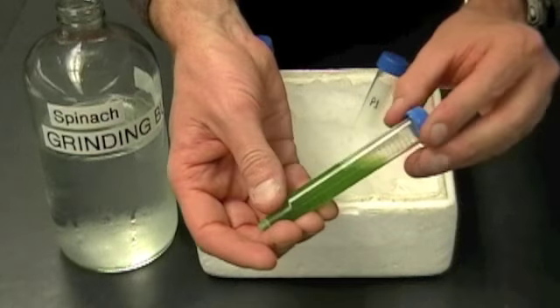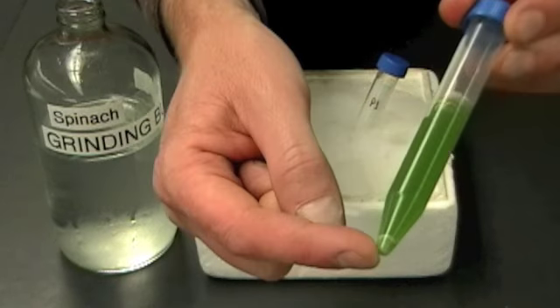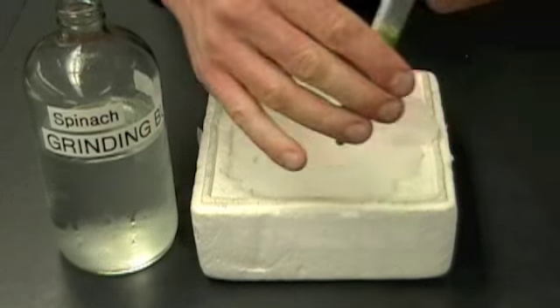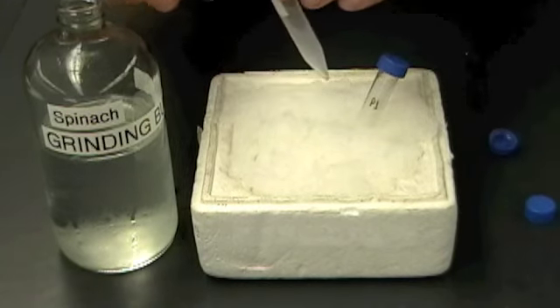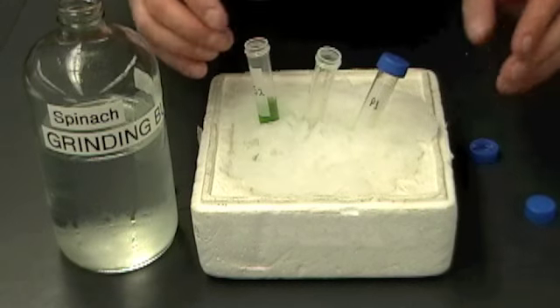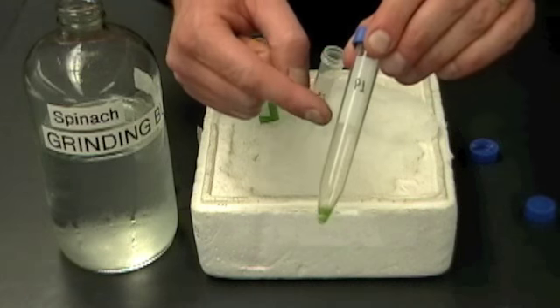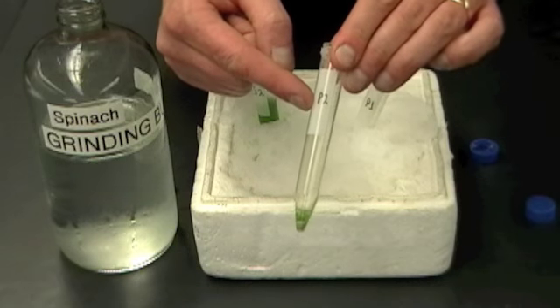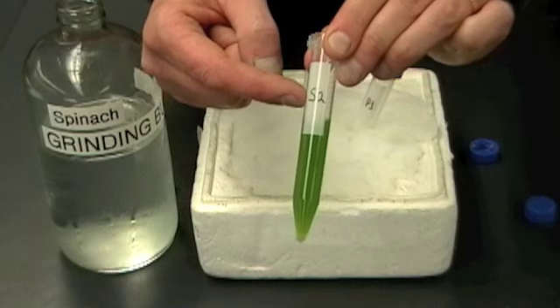Alright, so this is that first supernatant after it's been spun again at a higher speed. And you can see that now there's a new pellet down here at the bottom as well. So again, I have to separate the pellet from the supernatant. And when you're finished with this, you'll have 3 tubes, and I've already got mine labeled here. We've got P1 for pellet number 1, P2, that's the pellet produced in the second spin, and then finally S2, supernatant number 2.